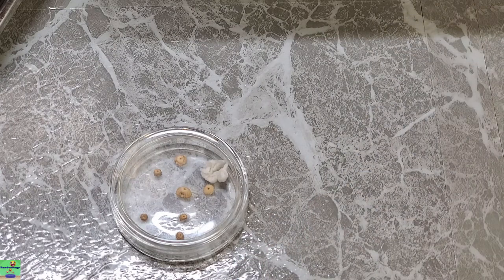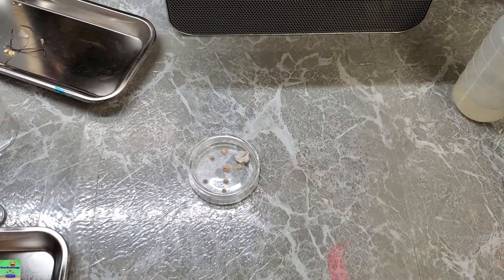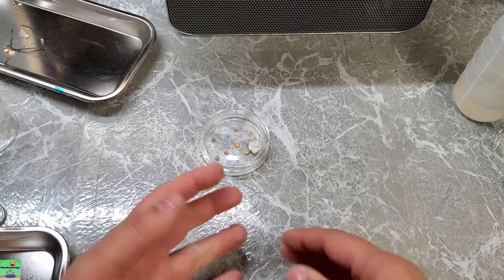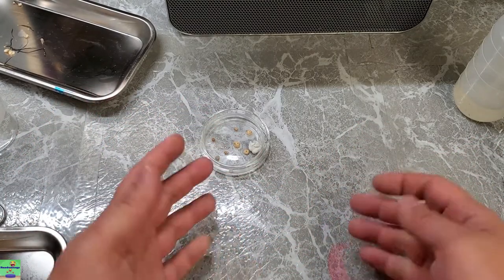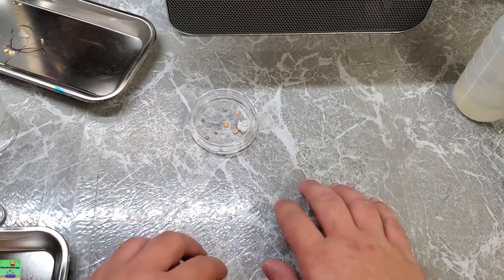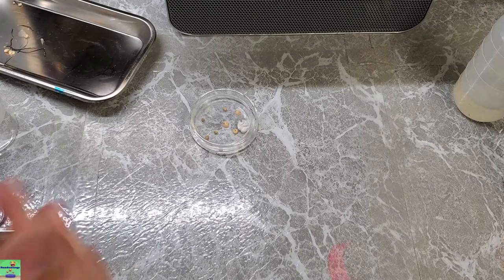Now, let me put this back into widescreen mode. Right here in the background, this is just my cheap HEPA filter that I got at Target. As far as air quality goes, even with a small one like this, I can work in the open here with my petri dishes and stuff, and I have a pretty low contamination rate. So this works pretty good. I did wash this down with some cleaning solution, some disinfectant. I have hand sanitizer right off to the side, so anytime I feel like I need to sanitize my hands, I can. And I think we're good to go. So let me get things set up and then we'll get to it.